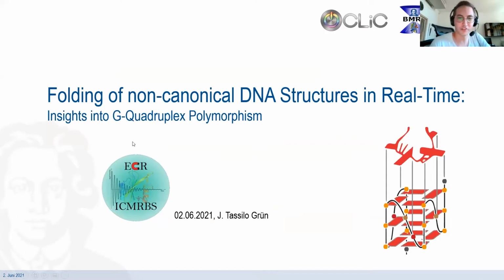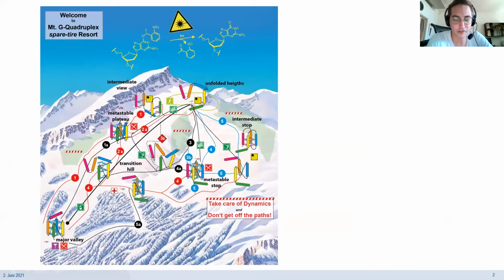It's a great pleasure for me to present to you some of my recent work, which is about the folding of DNA G-quadruplexes observed by time-resolved NMR. Typically, if you would talk about folding of biomolecules, you would always show some kind of representation of your folding energy landscape.